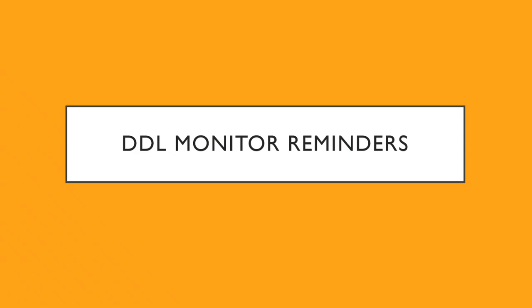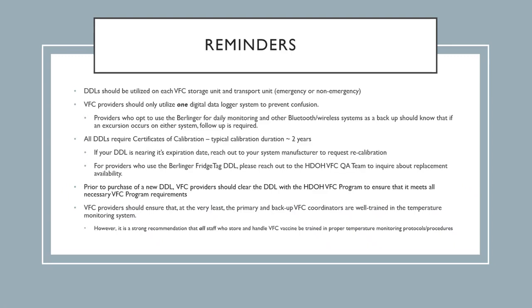Just some DDL monitor reminders. DDL should be utilized on each VFC vaccine storage unit and transport unit, whether it be for emergency or non-emergency. Providers should only utilize one digital data logger system to prevent any kind of confusion between the temperatures.